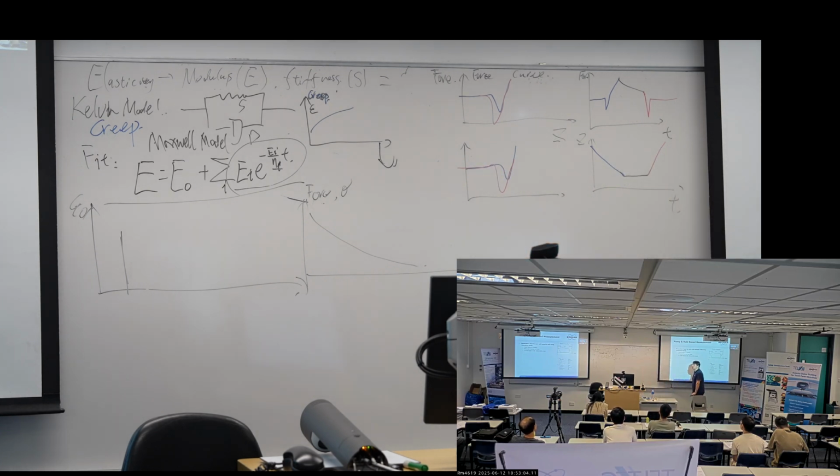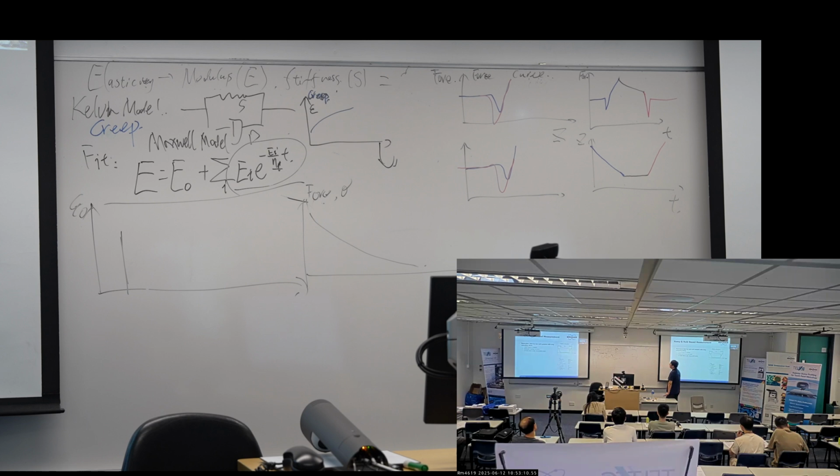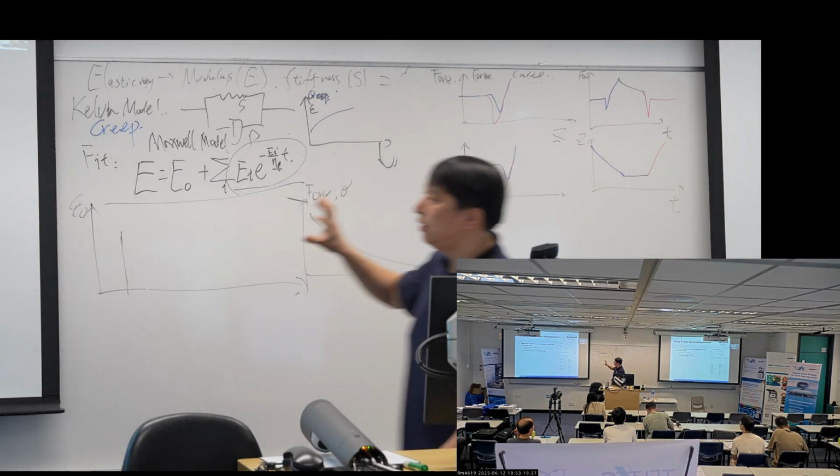That will be the force curves we are supposed to observe, right? That's for the relaxations.